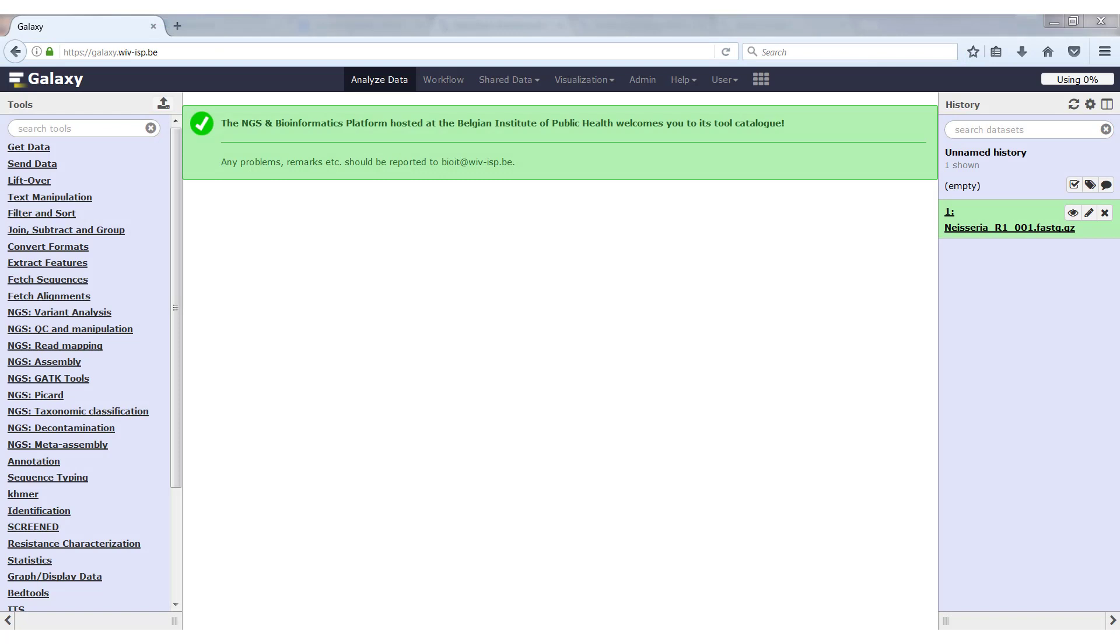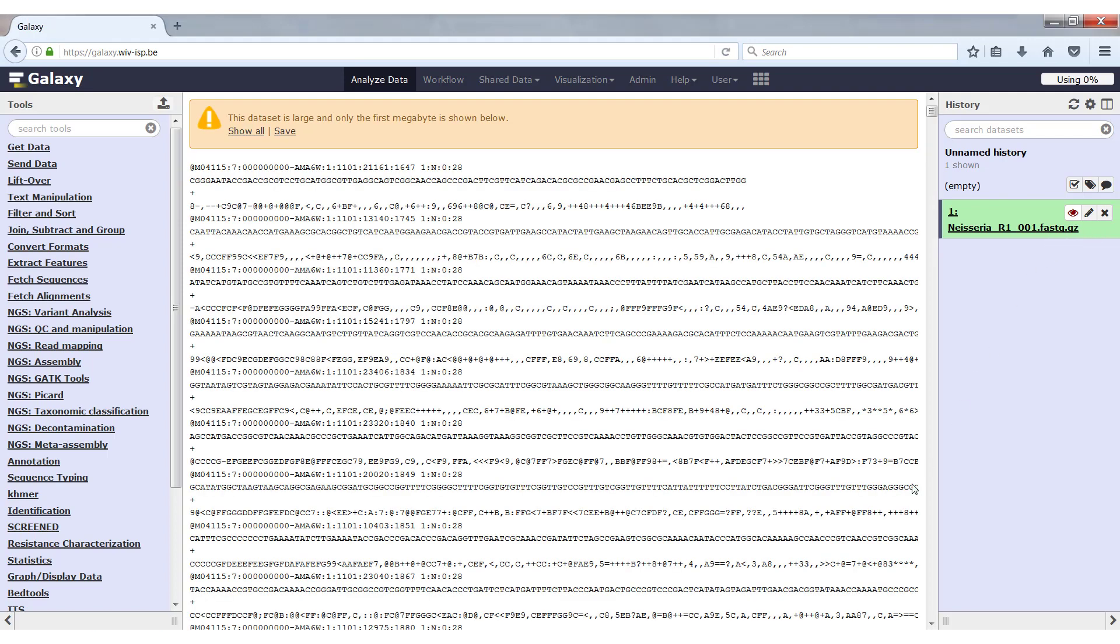To start, I have imported the FASTQ file into Galaxy and to look at the data we just have to click on the eye icon. This will open the first megabyte of the file in the central window.